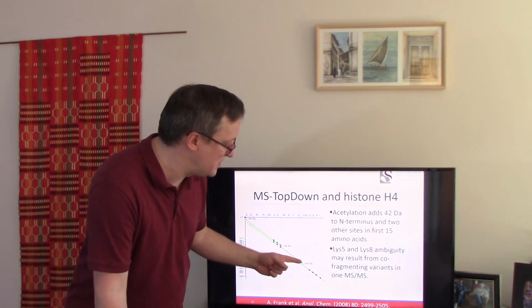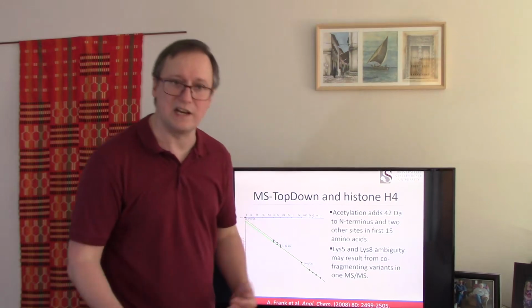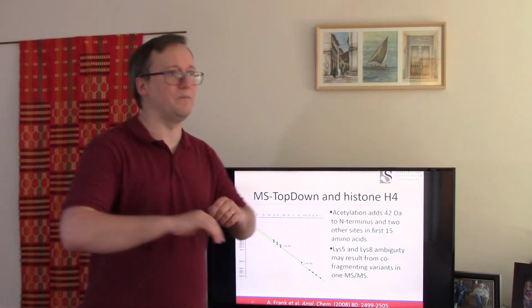But all of the spectral evidence agrees very strongly that K12 is acetylated for every copy of the ion that was observed in this tandem mass spectrum. So here you can imagine the software is trying to find the best way to add expansions within the sequence to reflect the added mass associated with PTMs. It has some total mass that the sequence mismatches it in.